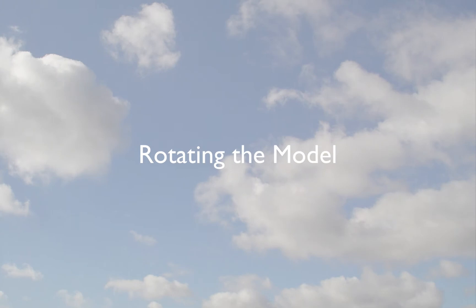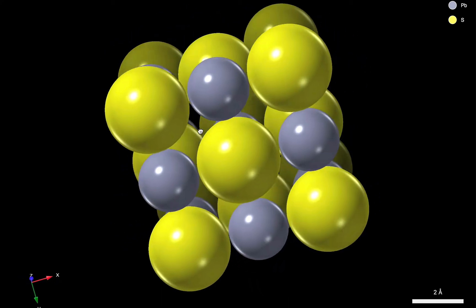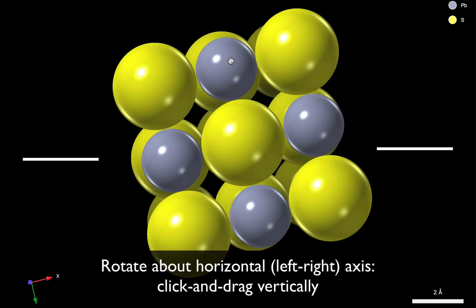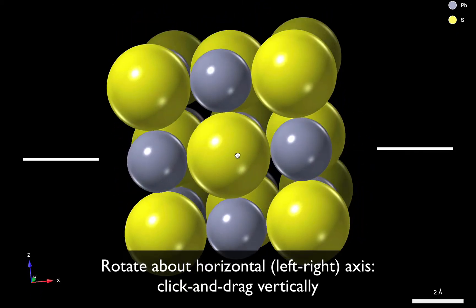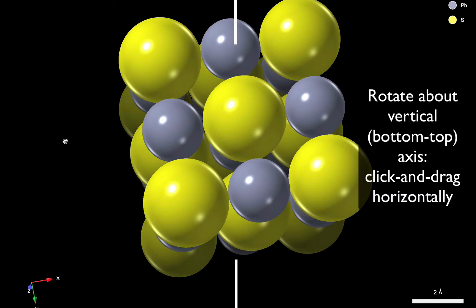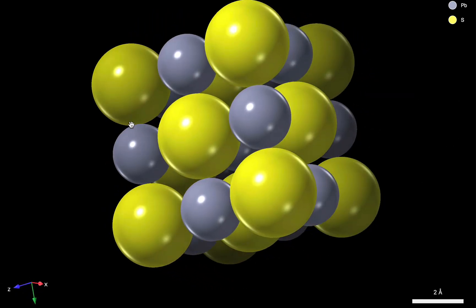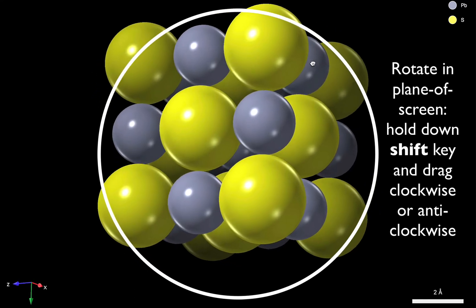Now let's talk about rotation. The easiest way to rotate is simply to click and drag with the mouse. So to rotate about a horizontal axis, we can click and drag vertically. So imagine that there's a rotation axis passing from left to right across the screen. Now to rotate about a vertical axis, then we drag left and right. And to rotate about an axis that passes out of the screen towards the viewer, we can hold down the Shift key on the keyboard, and then we can rotate in a clockwise or an anti-clockwise manner.